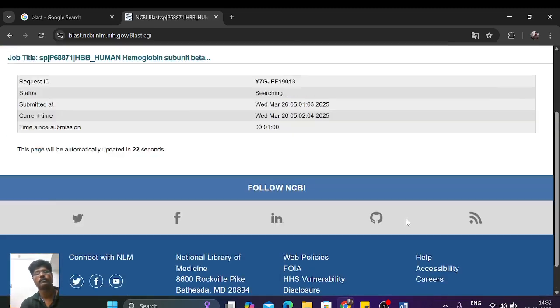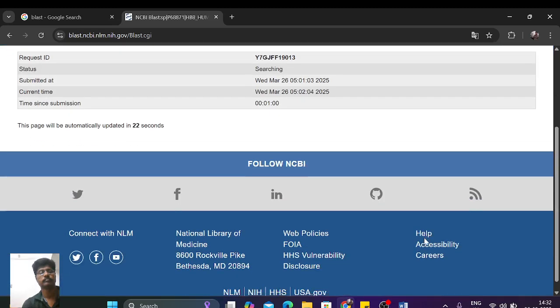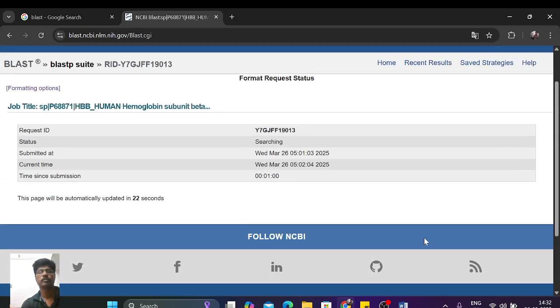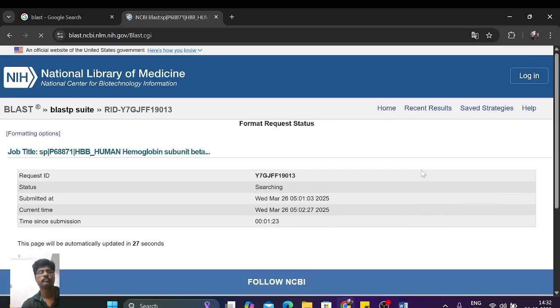Oh my god, what happened? Sometimes it may take time like that. Up to 27.